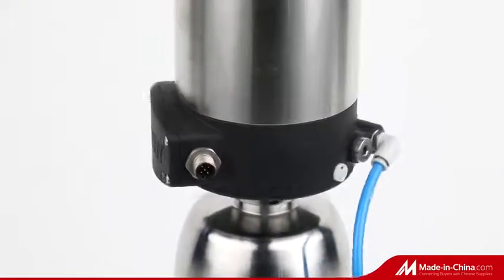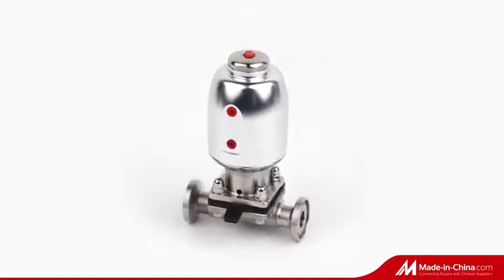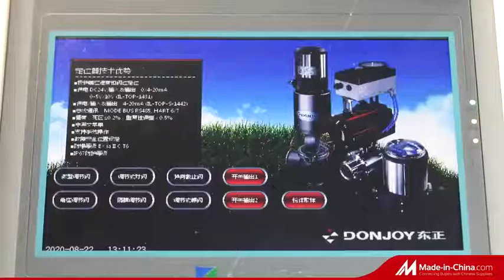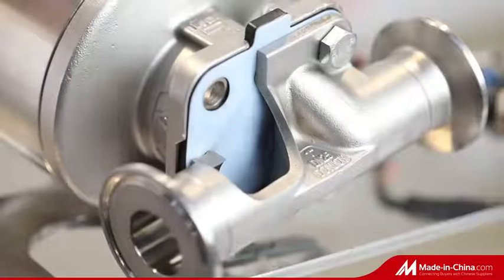Valve operates manually or pneumatically, specially designed for aseptic process and water treatment. There are four types of the gasket: PTFE plus EPDM, double diaphragm PTFE and EPDM, single diaphragm EPDM, and mini type.